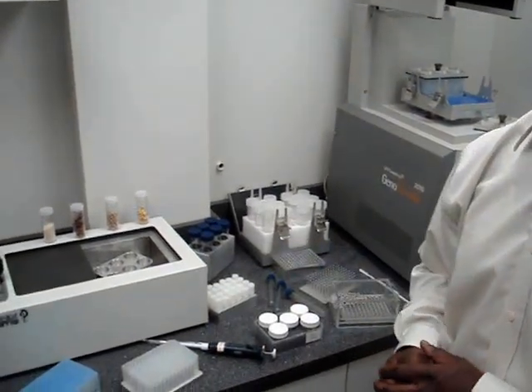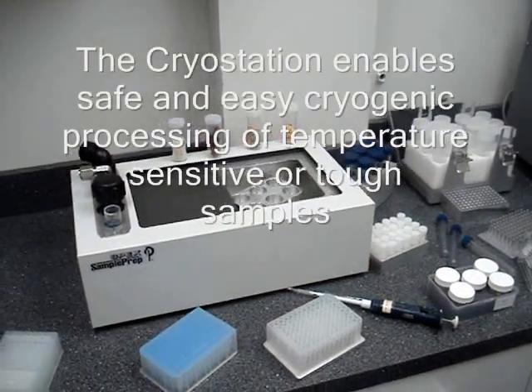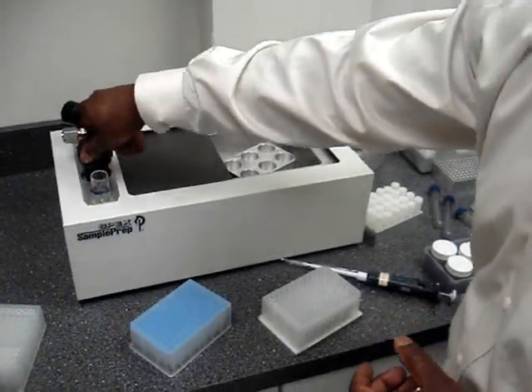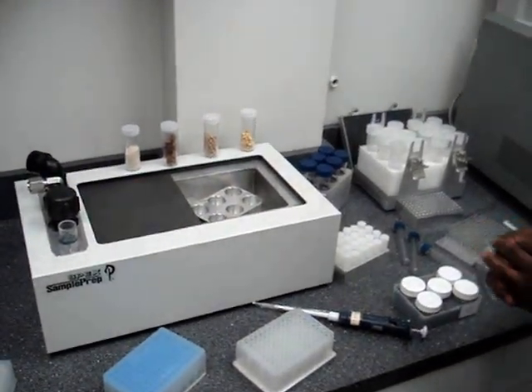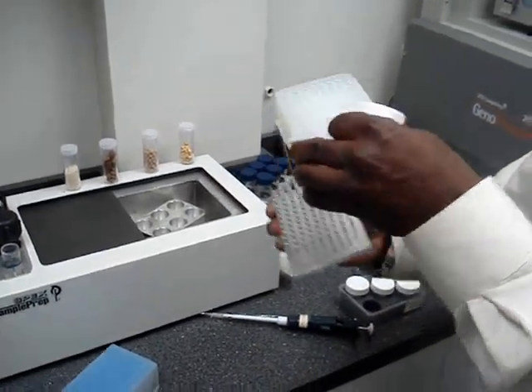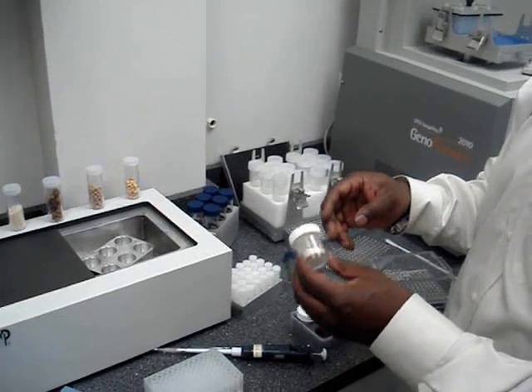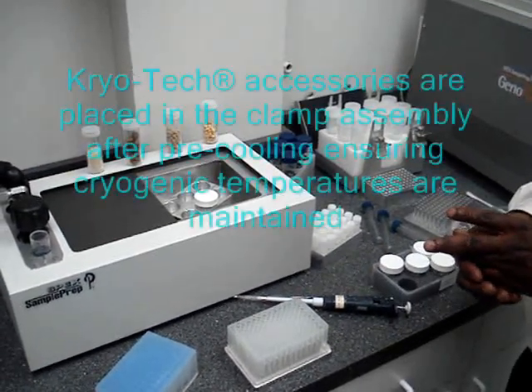I would like to talk about our cryo station. The cryo station accompanies our Geno Grinder as an option. It allows you to do samples down to liquid nitrogen temperatures without touching liquid nitrogen. You pour approximately 3 liters of liquid nitrogen inside the port, and the system will stay cold for approximately 3 hours at minus 192°C — almost liquid nitrogen levels. We have different formats for titer plates for keeping samples cold while grinding, especially for people doing RNA and protein extractions or samples that are heat sensitive. We have different vials designed for low temperature grinding that fit right into the format of the blocks we have designed. That is a trademark we call CryoTech Accessories.